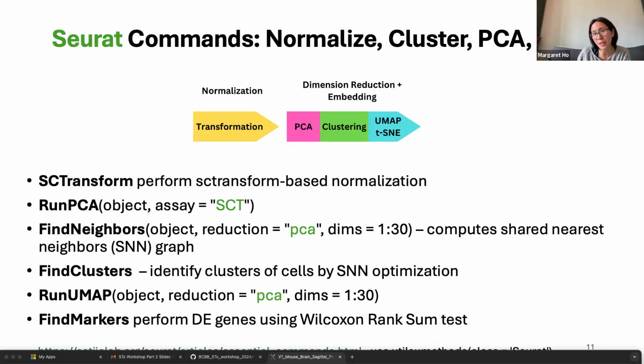So these are other Seurat commands that you will end up seeing in the R code. We're going to essentially be doing pre-processing of the data. And this is a type of analysis that's called unsupervised analysis. It's very similar to what's being done in single-cell RNA-seq analysis as well. So we have count data that needs to be normalized. We have essentially excess variance in the data, and SCTransform is the algorithm within Seurat that's available to us to normalize that data.